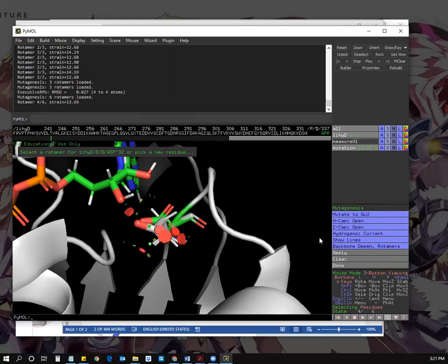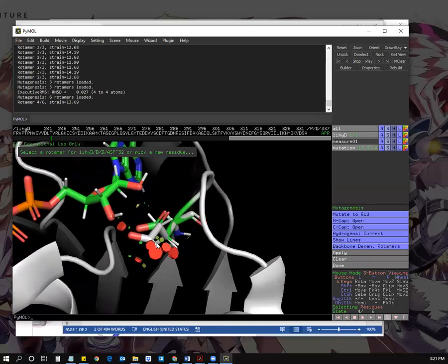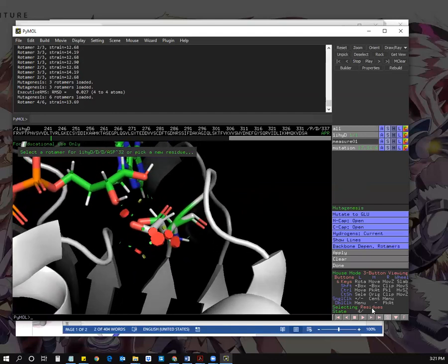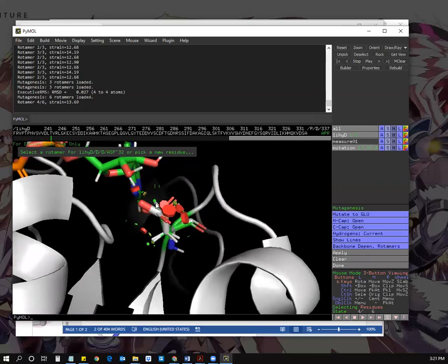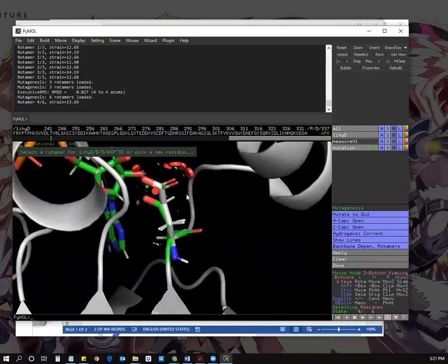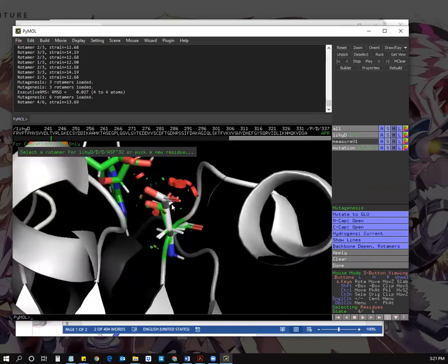When I click on that, the gray clone ghost basically changes into the glutamate, which is 1 carbon longer. And now we can see that we are presented with 6 different rotamer conformation possibilities, and we're currently seeing the 4th one here. To me, this just looks great and it looks perfect. So you can see the old aspartic acid residue there at the bottom.